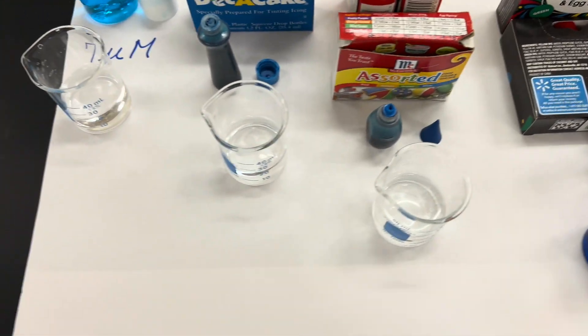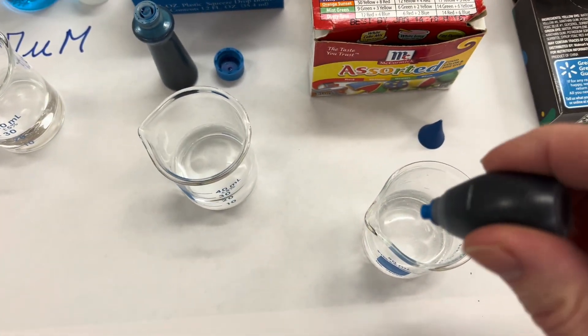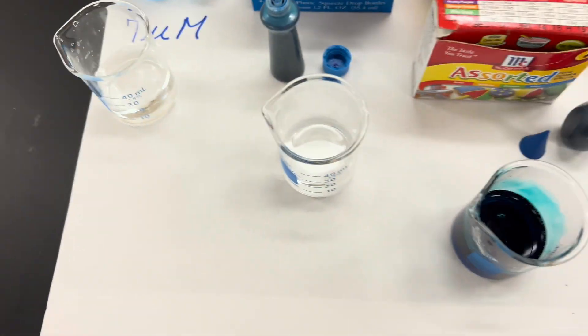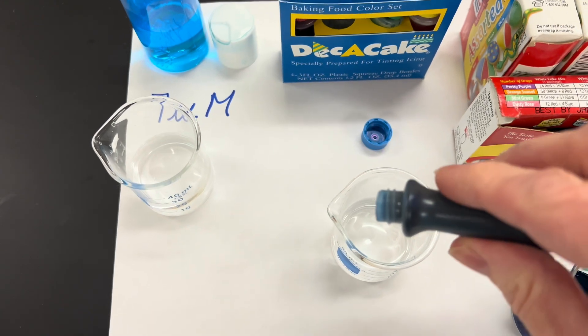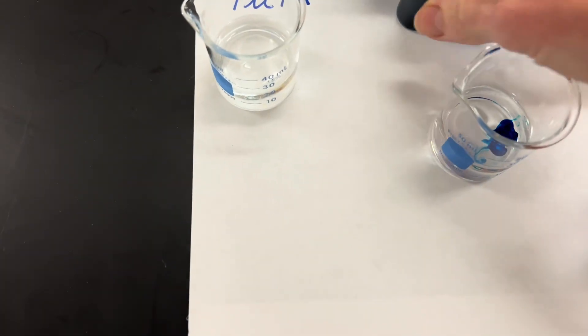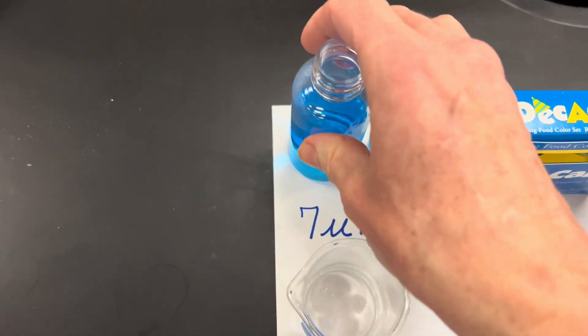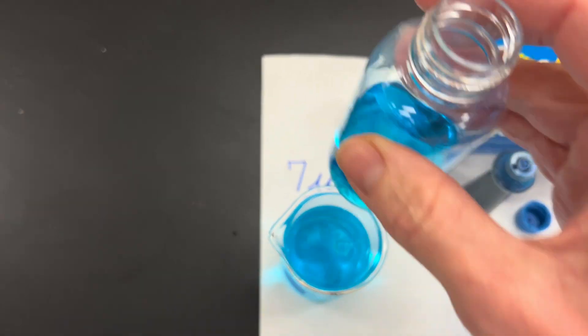I'll show you the labels in a second. This is a McCormick brand. I got two drops in that one, so it's a little darker. This is a DECA Cake brand — and that one immediately was just a little bit lighter. And here's my 7 micromolar that I make from the solid blue dye.